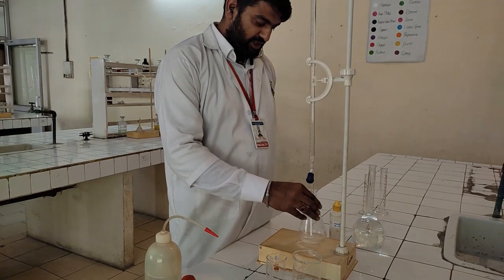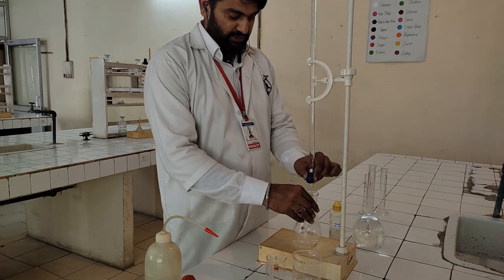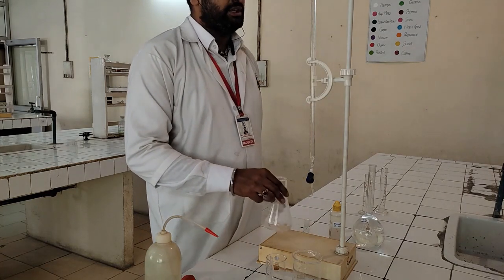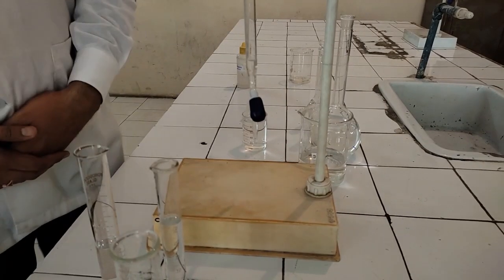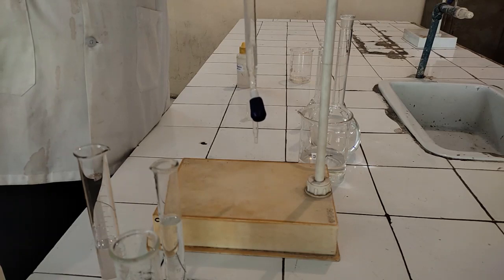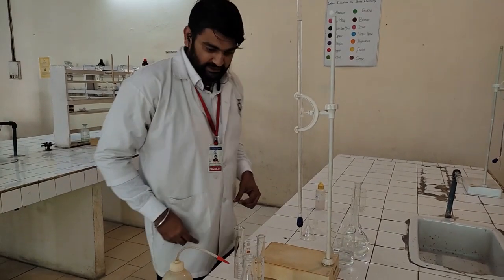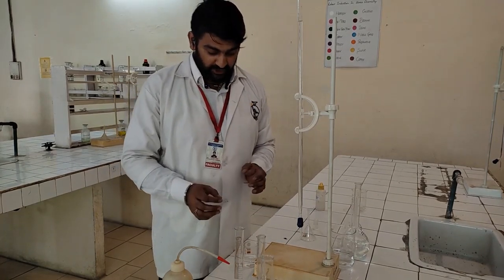As you can see, now the solution has been decolorized, so it marks the end point. Stop the burette and note down the reading from the burette. Take 3 readings for the standardization purpose. As our solution is standardized, now we are filling the burette, after emptying and cleansing, with the standardized NaOH solution. Now our burette is filled.